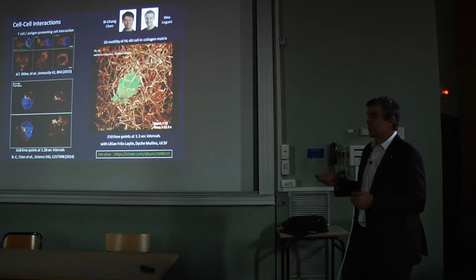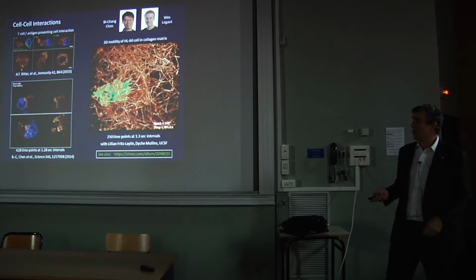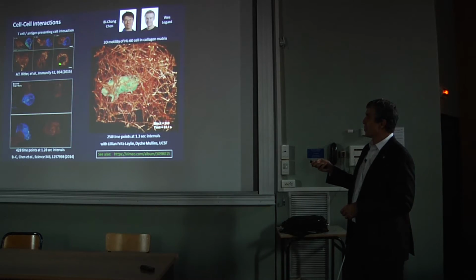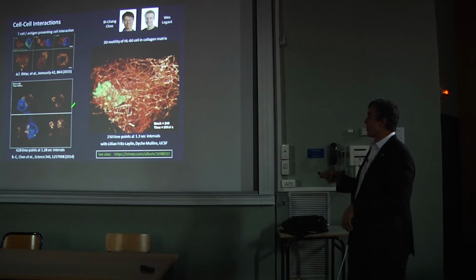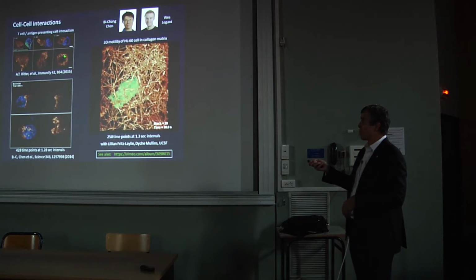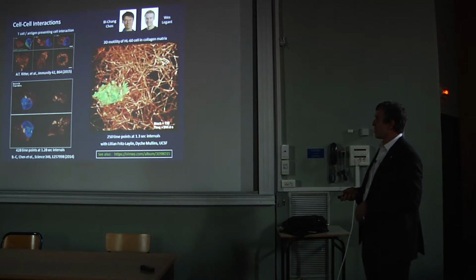So the next level up is to look at cell-cell interactions instead of single cells. So here's our good friend, the T cell we saw in TIRF SIM before, but now not against a cover slip, but against a real dendritic cell. And so as the immunological synapse forms, eventually before there's this cytotoxic granule release to kill the target cell, there's an opening up of the actin, like a lamprey or something, in order to be able to deliver it. We also find this extremely fast flow of actin away and along the sides of the T cell.